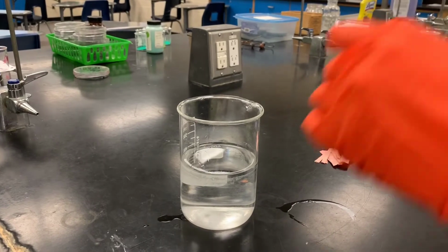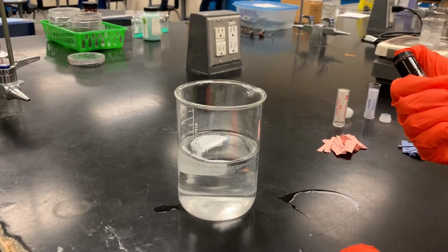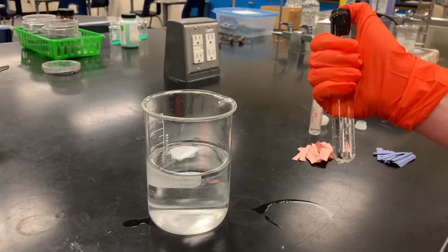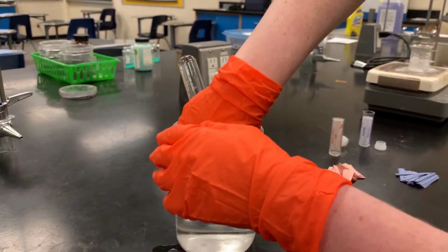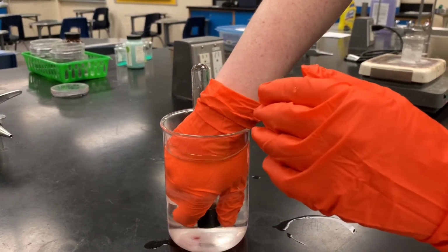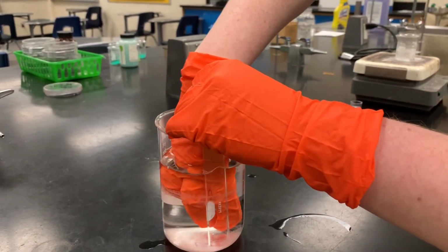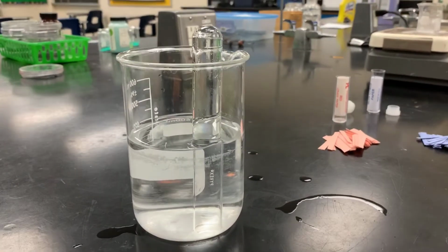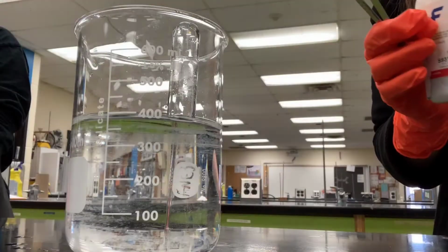In this part of the lab, we need to do a technique called downward displacement. So what we've got is a beaker half filled with water and a test tube completely filled with water and a stopper. So we're going to invert that test tube into the beaker of water, and then we're going to carefully remove that stopper. There we go. And we now have a completely filled test tube with water inverted into a beaker.